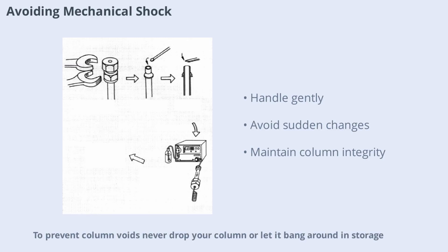To prevent column voids, never drop your column or let it bang around in storage. Avoid sudden pressure changes, do not switch to immiscible solvents abruptly, and never reverse the column flow or jump flow rates suddenly. Gentle handling and gradual changes are key to maintaining column integrity.